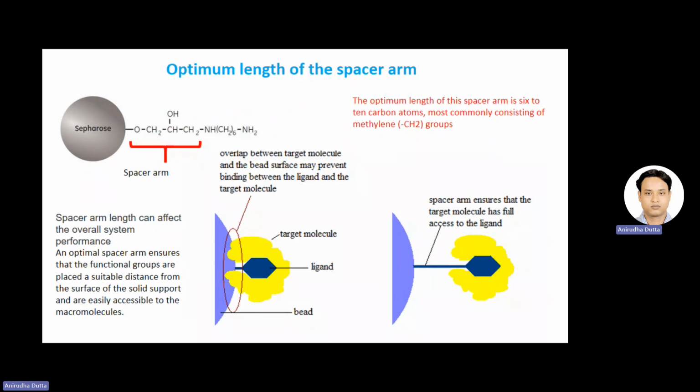Okay. So how exactly does a nickel matrix bead look? You'll see an inert bead that is made up of a large polymer of carbohydrate like sepharose, Superdex, or those kinds of things. The dark round shape part of this bead represents the inert part of the bead. This is just the matrix where we can immobilize our ligand, so it has no other function than being an inert matrix for ligand immobilization.